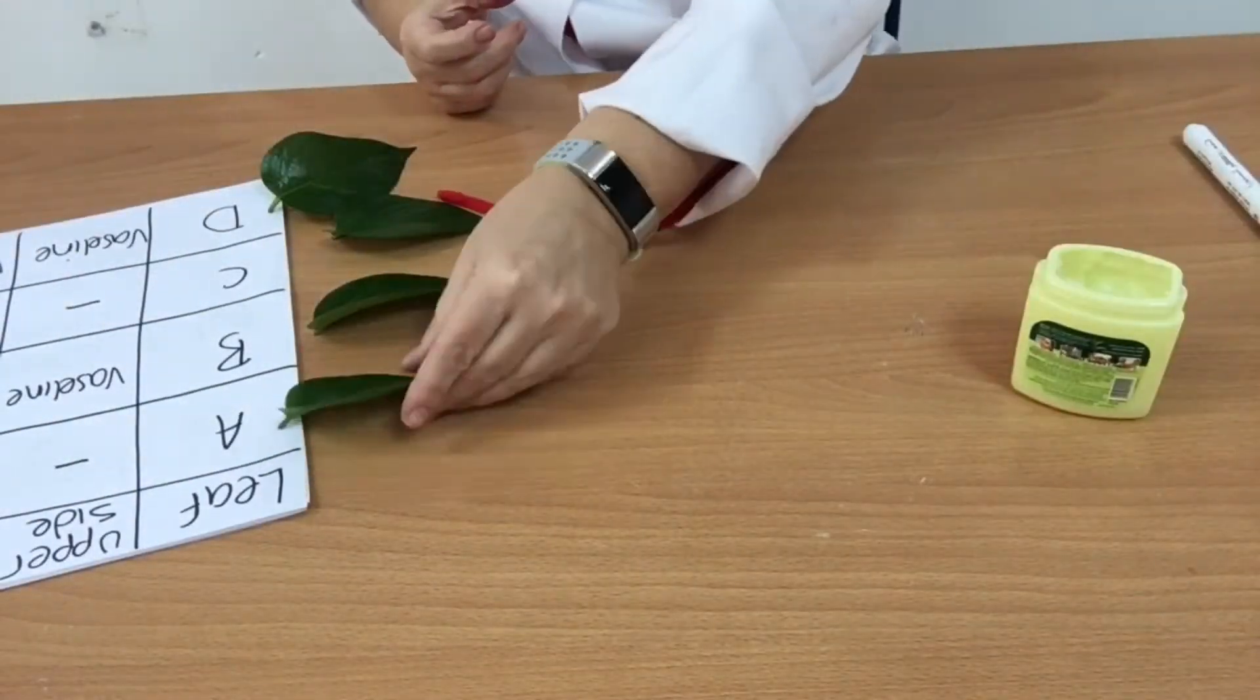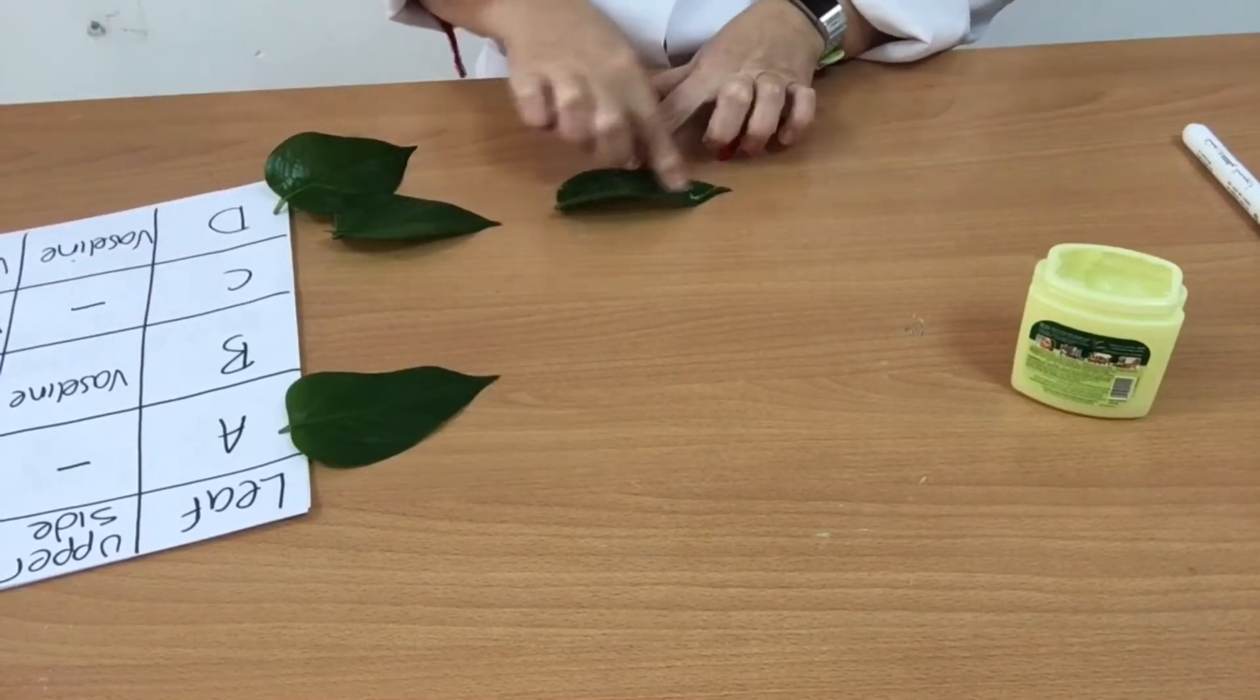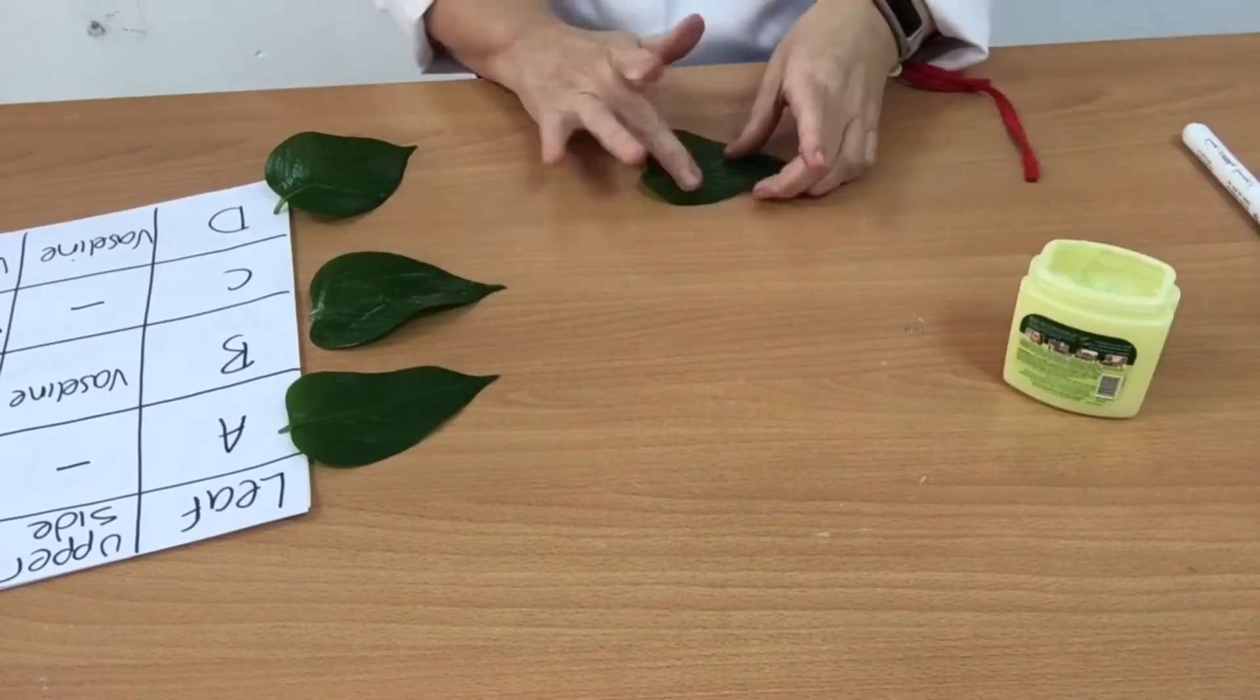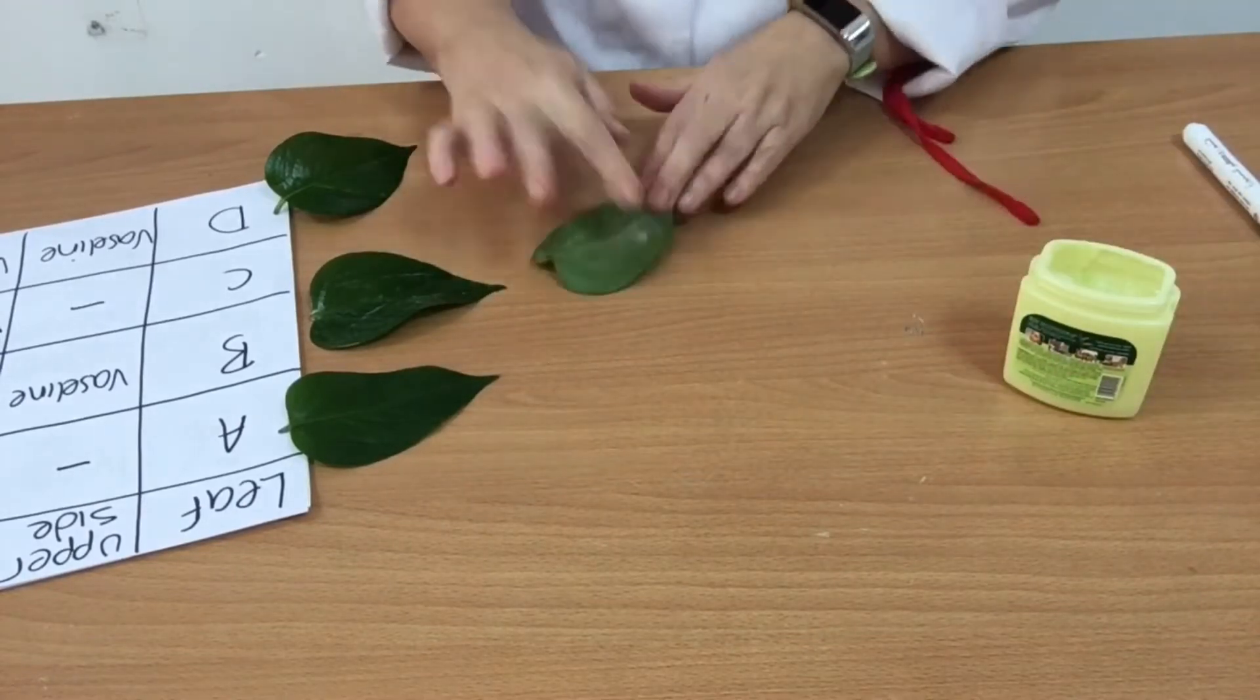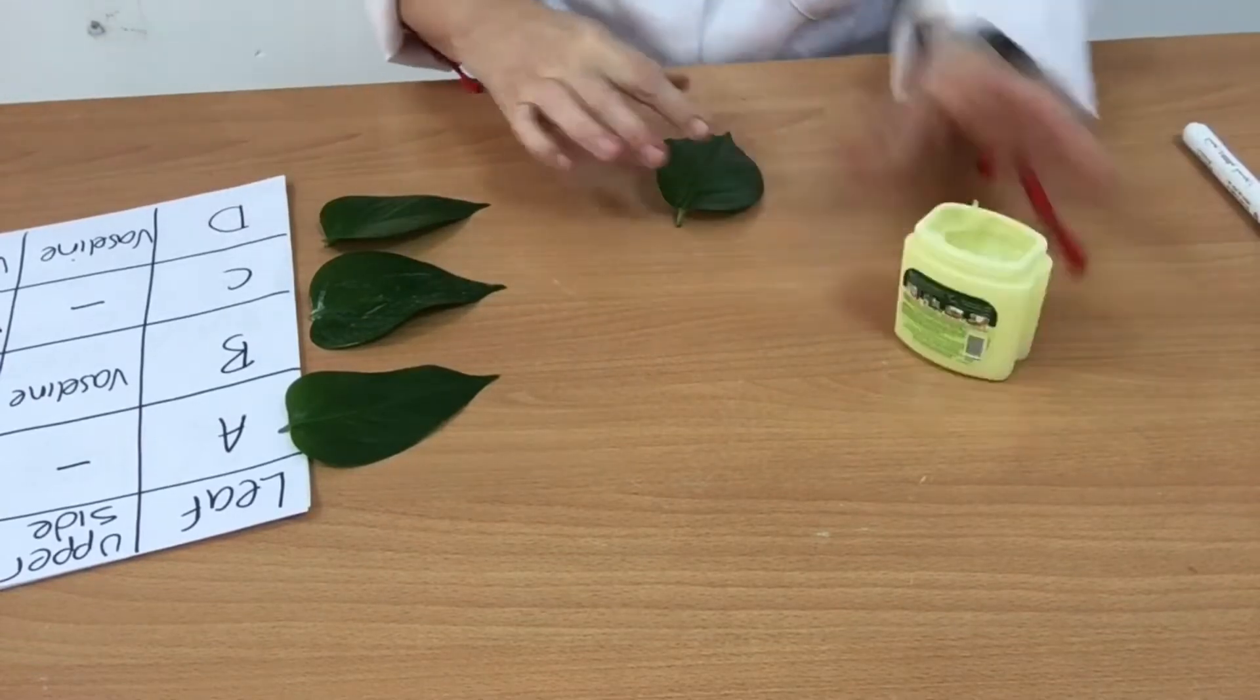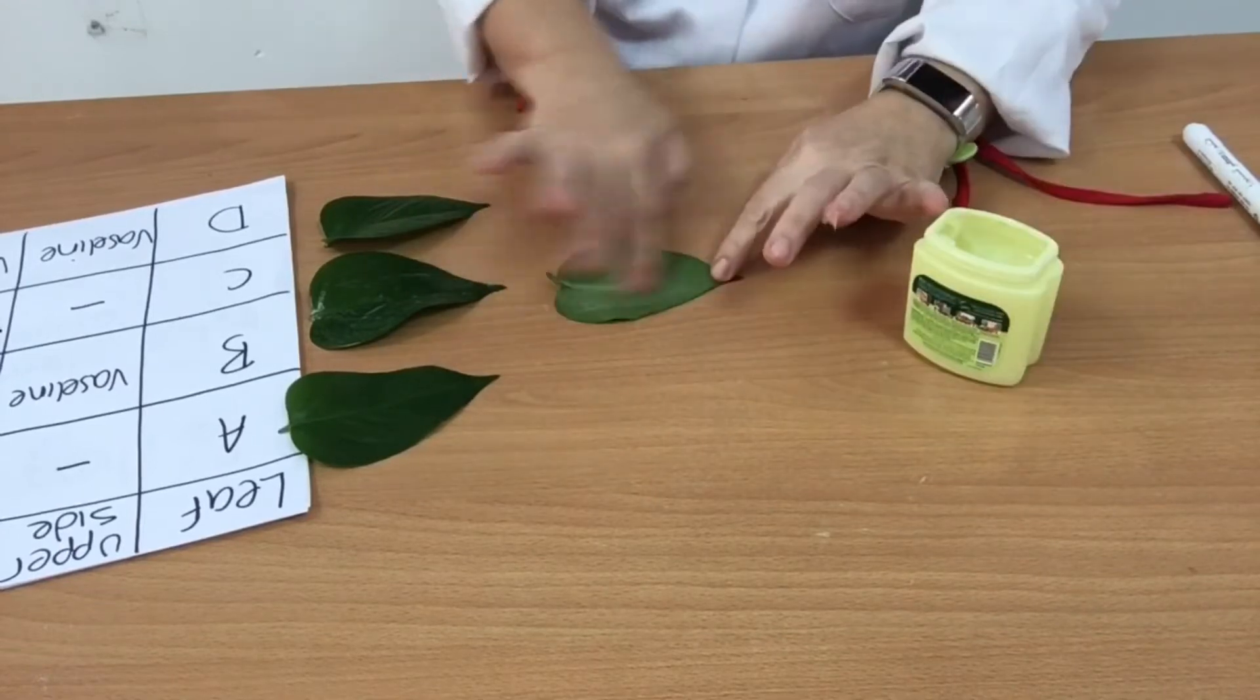Time to apply the Vaseline. The first one doesn't need any Vaseline on either side. The second one gets Vaseline on the top. The third one needs it on the bottom—spread it all over, making sure it's worked into every bit. On the last leaf, I'm doing it on the top, then turning it over to do the bottom.